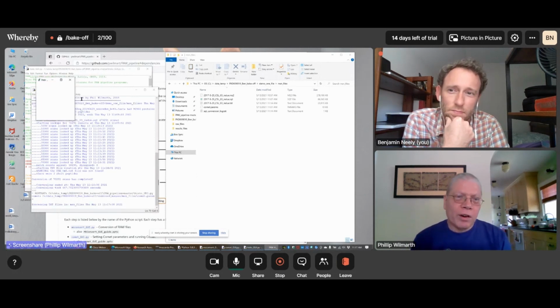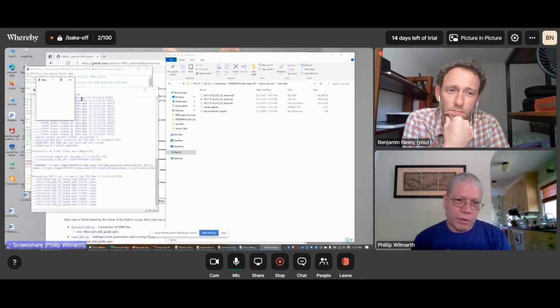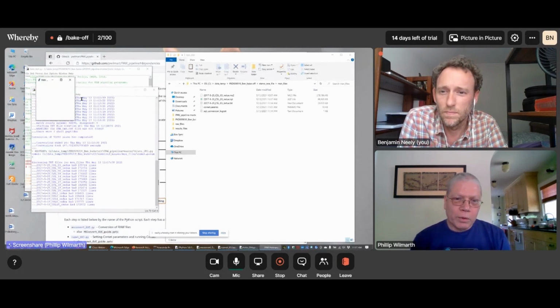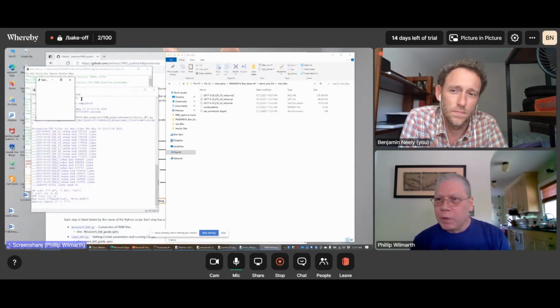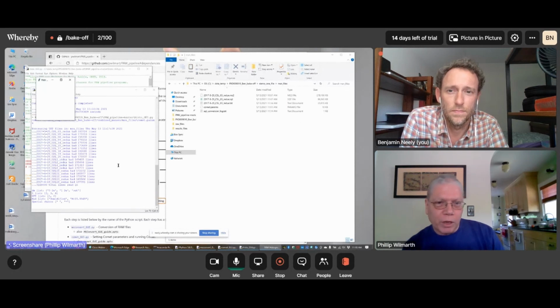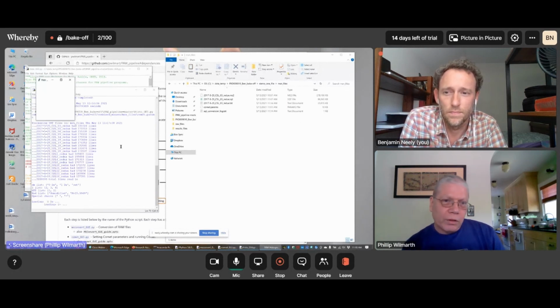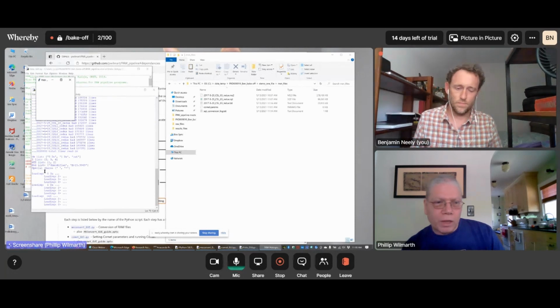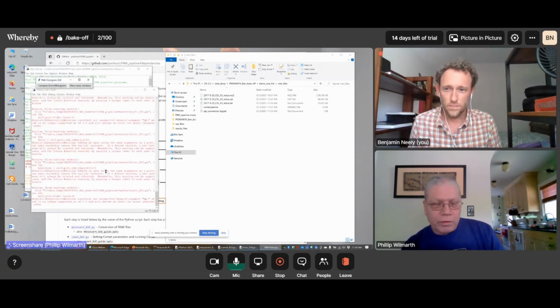Now the first thing we want to look at here are the mass agreements between the sequences that were assigned to the peptides and the mass of the ion that the instrument measured. Normally we expect correct sequence assignments and the mass of the peptide to agree very well, basically have a 0 Dalton discrepancy for the delta mass. And we'll make a delta mass histogram using the target decoy method. We have to build databases with decoy sequences when we run the pipeline. And we'll see what those look like here in a second. The first thing it does is it reads everything in, and then when it's high resolution data, we skip the 1+ ions and just look at 2s, 3s, and 4s for the ions.